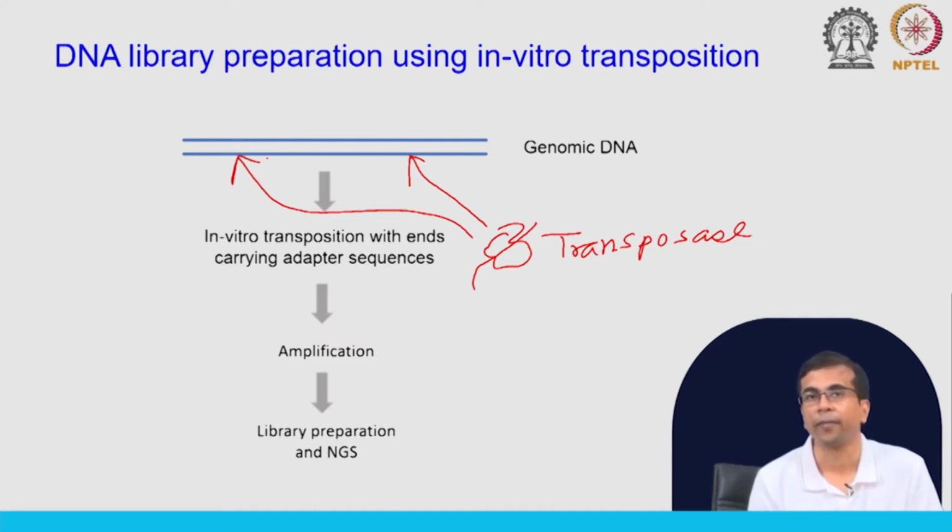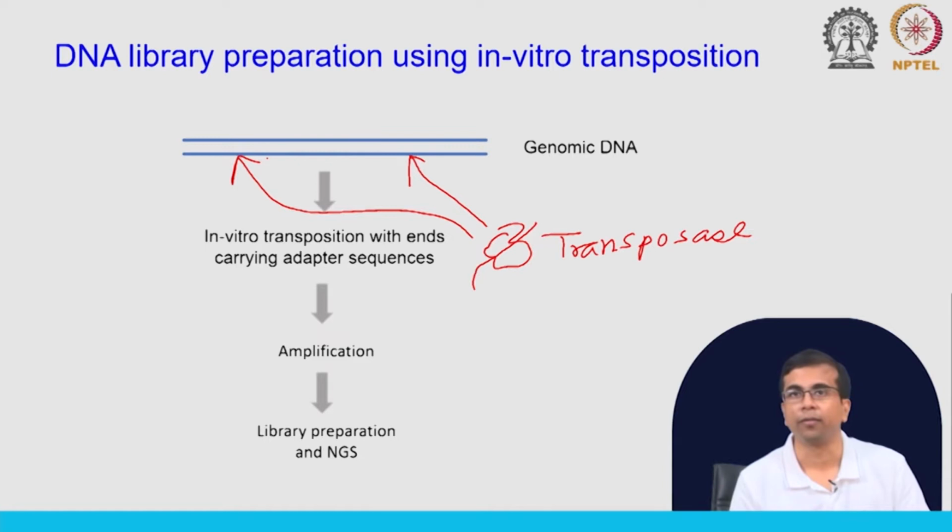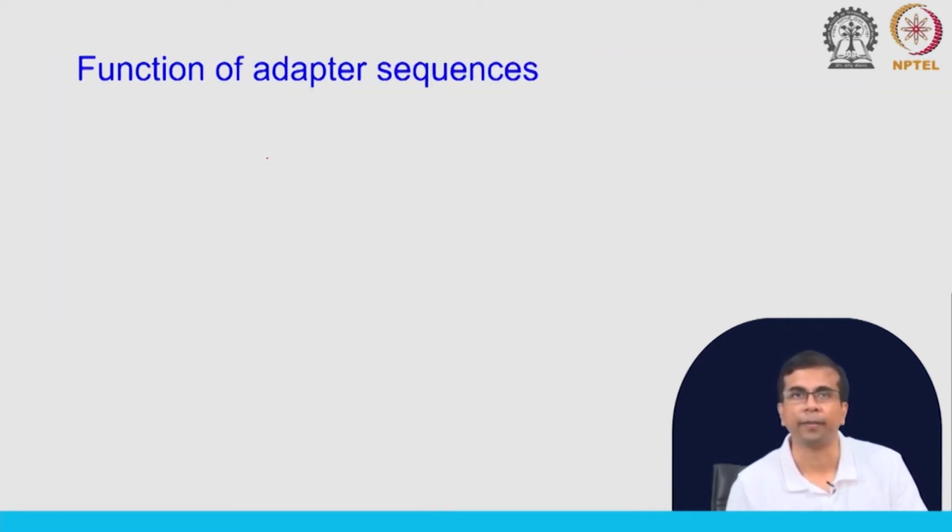go for NGS. So, you can have this library preparation step, which again could be specific to the platform. So, you can use these two methods. You can also do this transposase method. In some cases, this might be the only solution that you have.